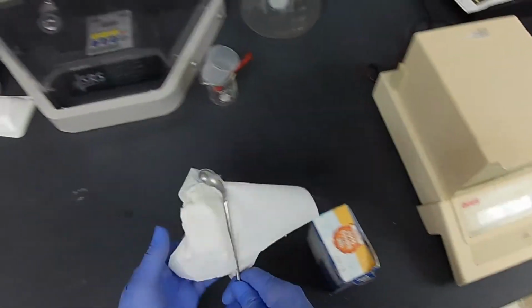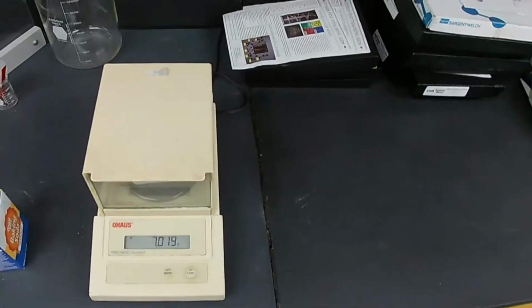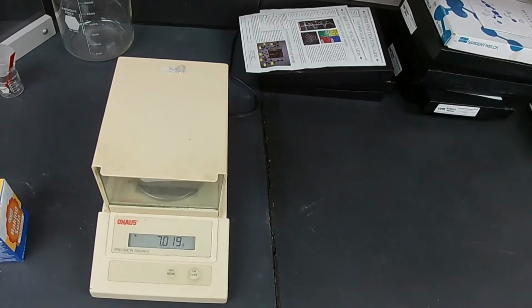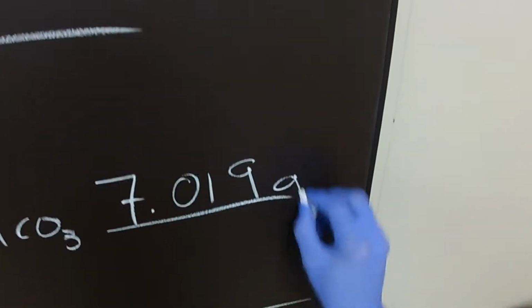Let's close the lid and get a final mass. 7.019. 7.019 grams.